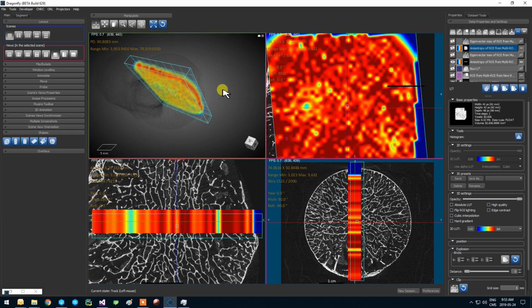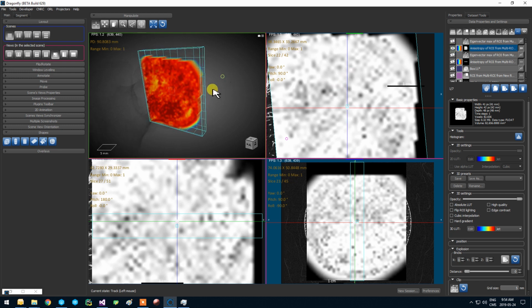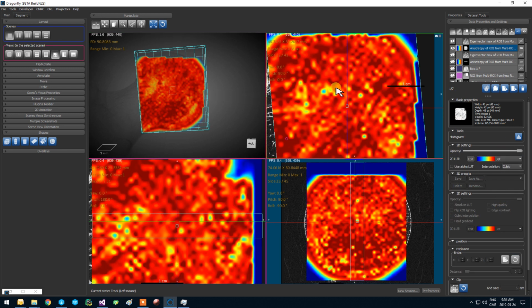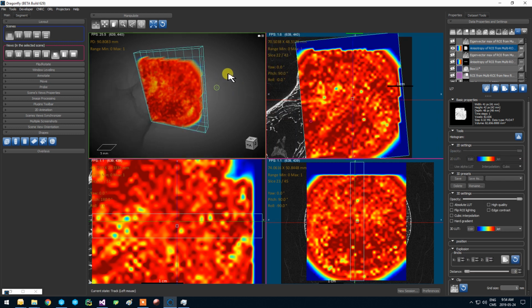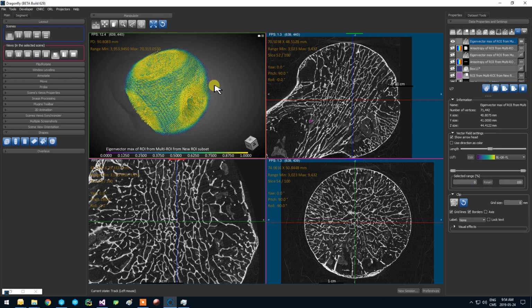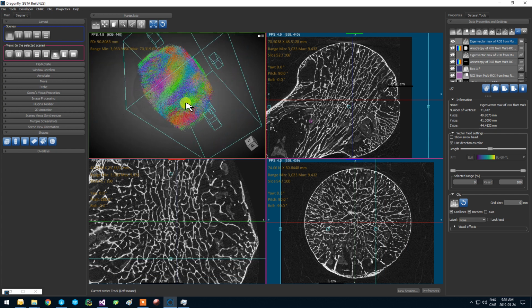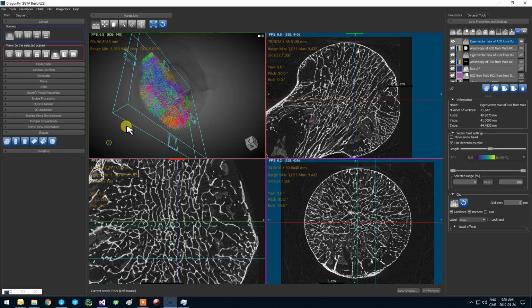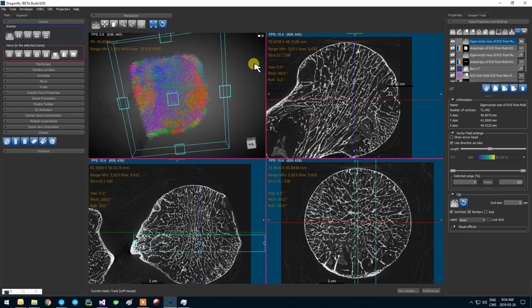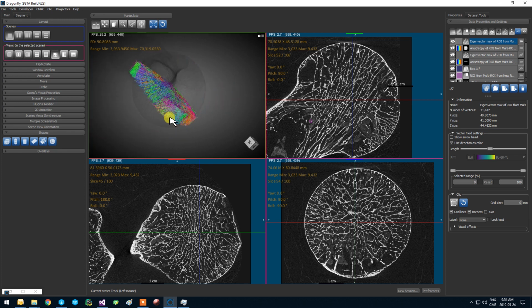So if I just do this, I should obtain the same result since the points were about the same. And then in here I will put it in the same color map, jet as well. It's still very noisy, a bit over-evaluated. And the vector field as well, you can clip. But we don't see much of the structure with this orientation. Again, let's try with the surface normal.